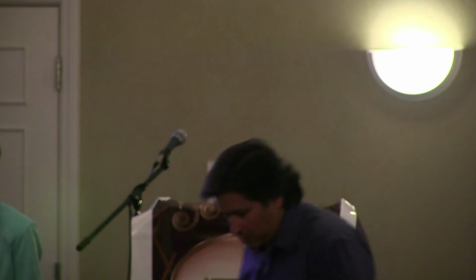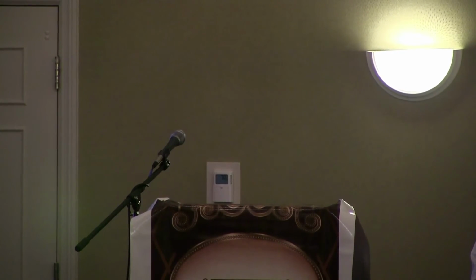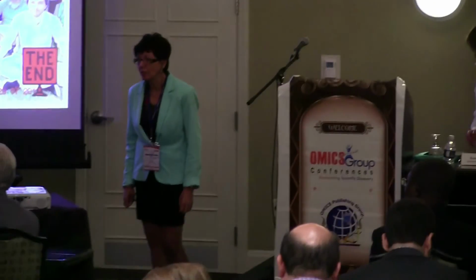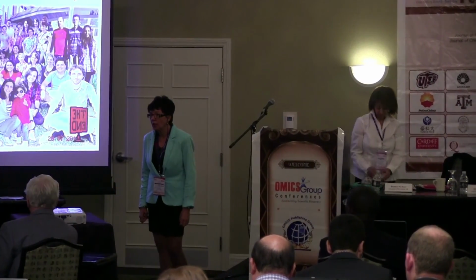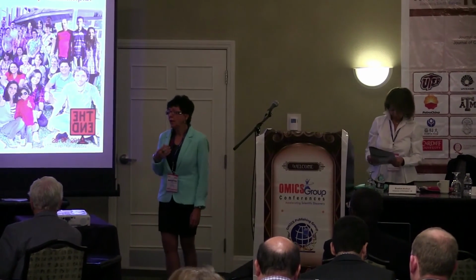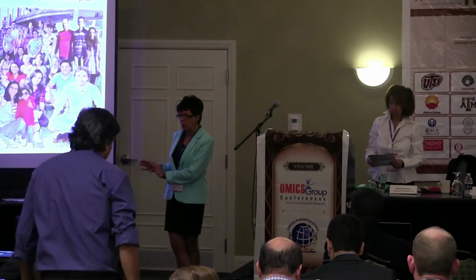Okay, but it's extremely challenging to ionize large saturated hydrocarbons, and there are only a few methods known today. So your talk really focused on just the 10% of the polar compounds. The 70% of saturated hydrocarbons you cannot analyze using the methods you discussed. Yes, I said this because nowadays they work with these polar compounds.